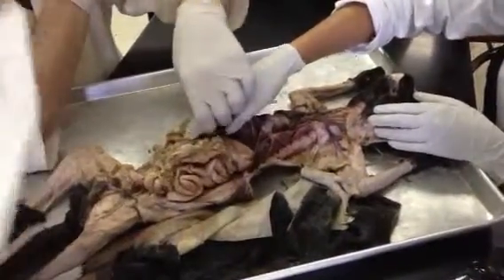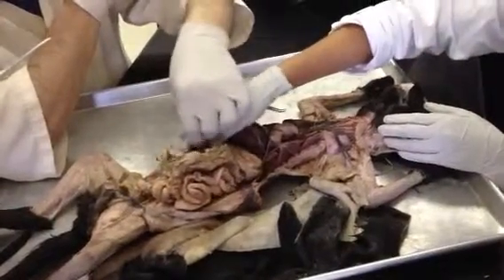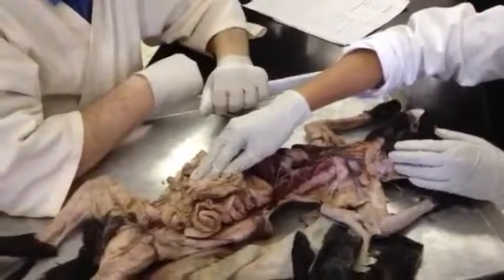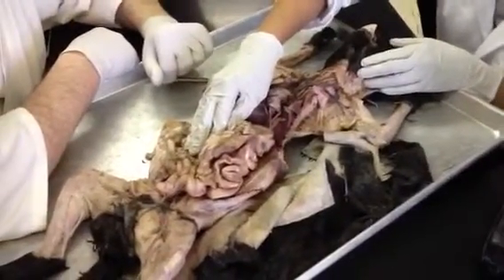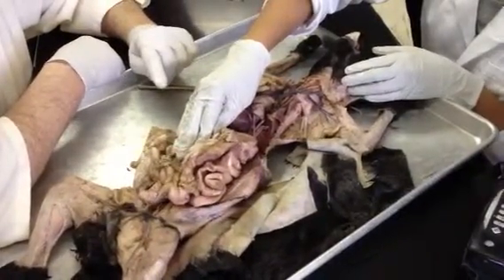That's called the omental bursa. The omental bursa is where these little rivulets of fat are located, inside the mesentery. Omental bursa. You all right with that? That's coming off the greater curvature of the stomach.